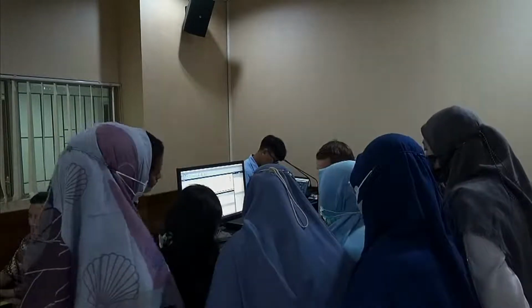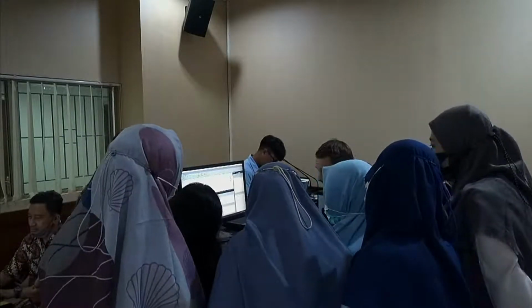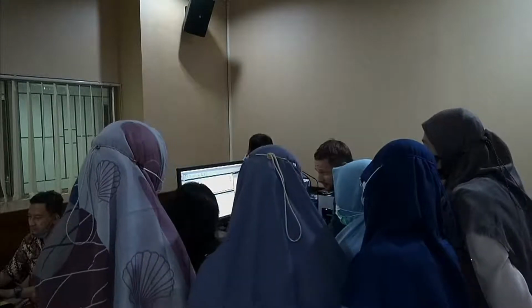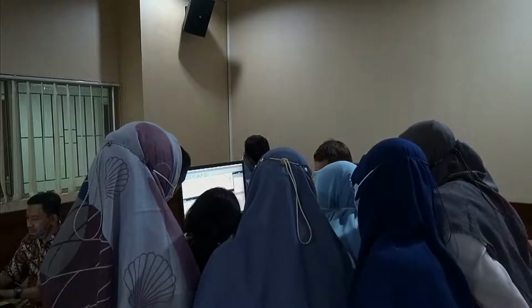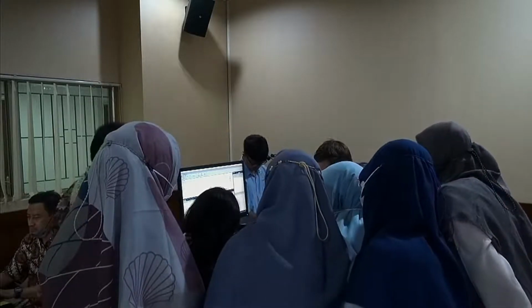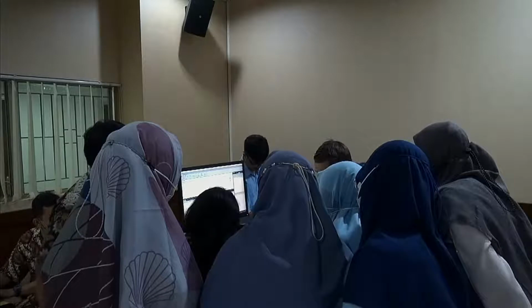These are two usually very, very simple and easy samples. Let's check the coconut milk. Compared with the F500, you see it's a finer material. The coconut milk is much finer, especially we will find also things here even below 1 micrometer.